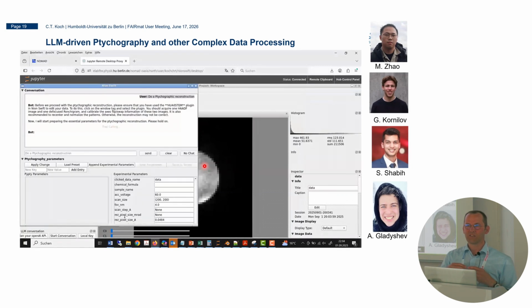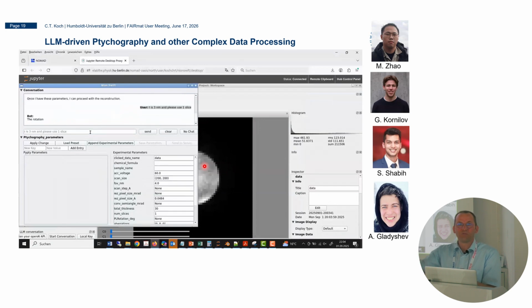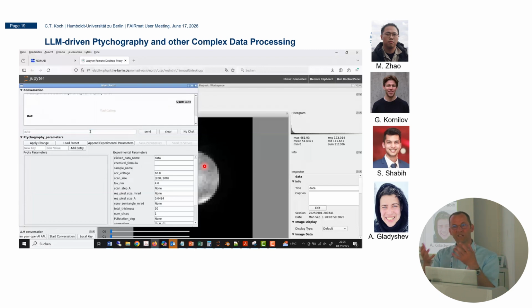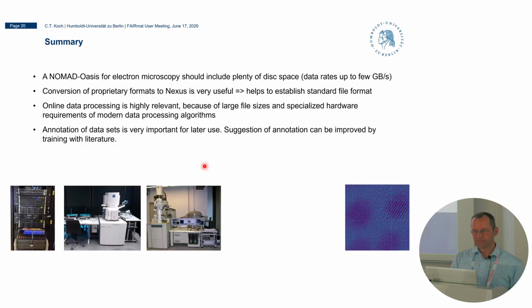We actually share a lot of data with external users. They come to us for experiments, and we send them a link, here's your data. They typically don't know how to operate our software, but we tell them there's an LLM tool. Just open that one and ask it questions, and as long as you know what you want to do, it walks you through the process of getting to your results. Anyway, I will stop here.